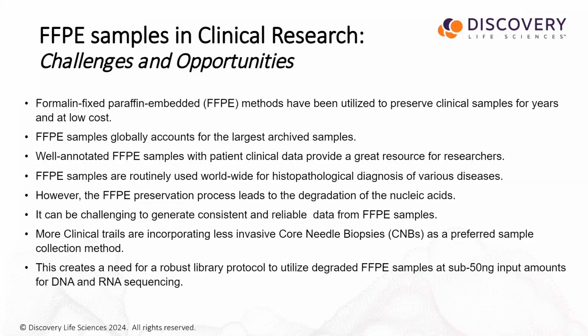Jumping into the FFPE samples in clinical research, and focusing more on the topic of today, why we are here today, I want to take a step back and lay out some brief points. The formalin-fixed paraffin-embedded, or FFPE, method has been utilized to preserve clinical samples for years at low cost. We are talking 15, 20 years, maybe more, for some of these samples. FFPE samples globally account for the largest archived samples. By some estimates, it tops around 1 billion samples that have been archived. That's a huge amount of samples.